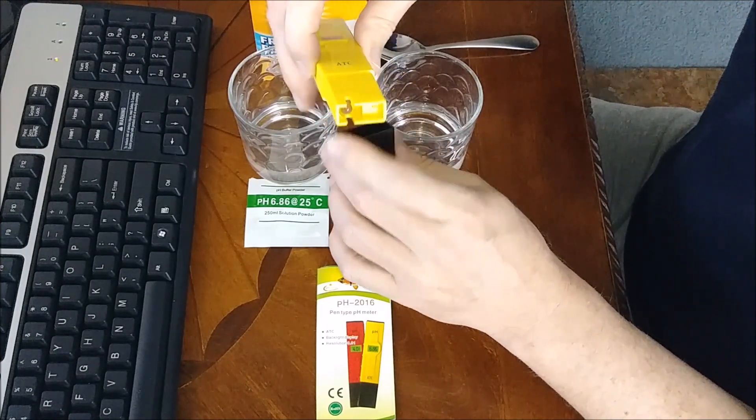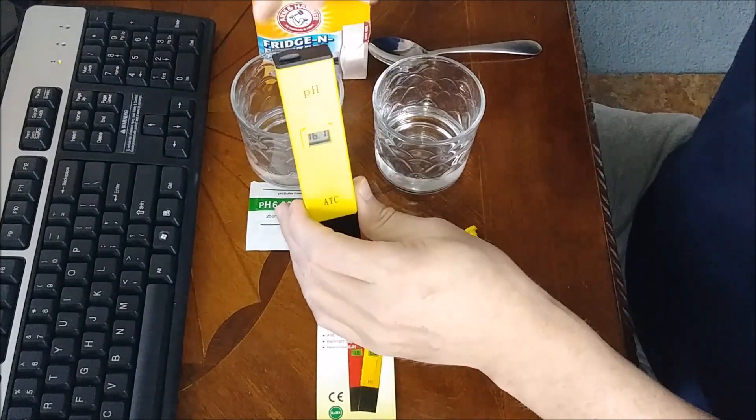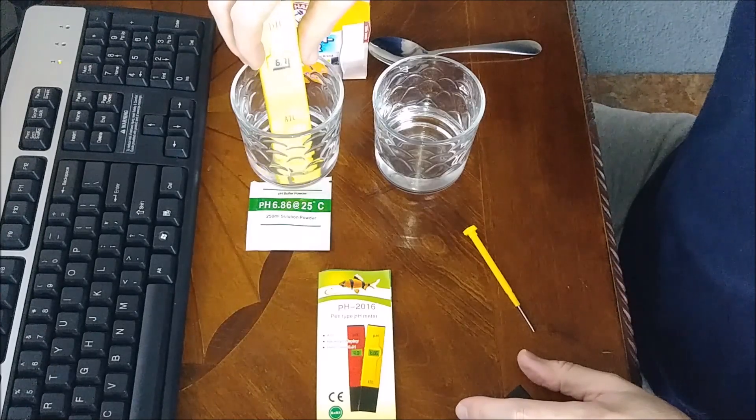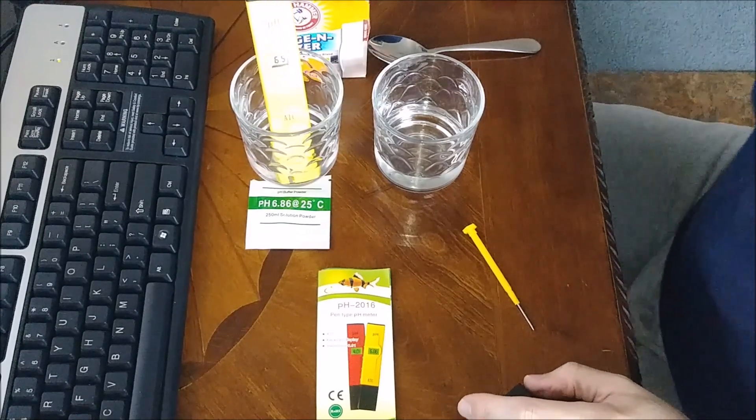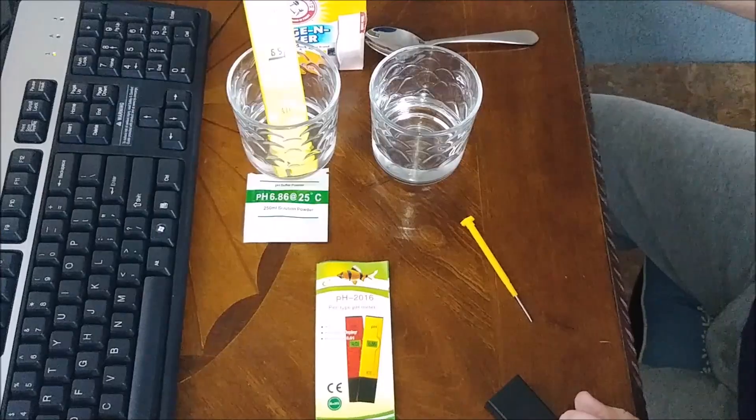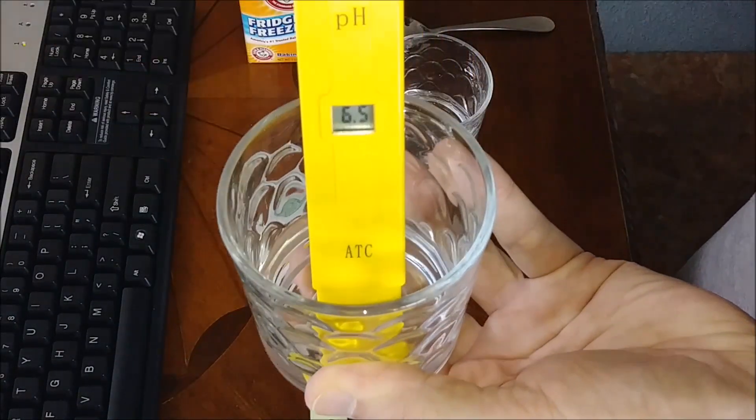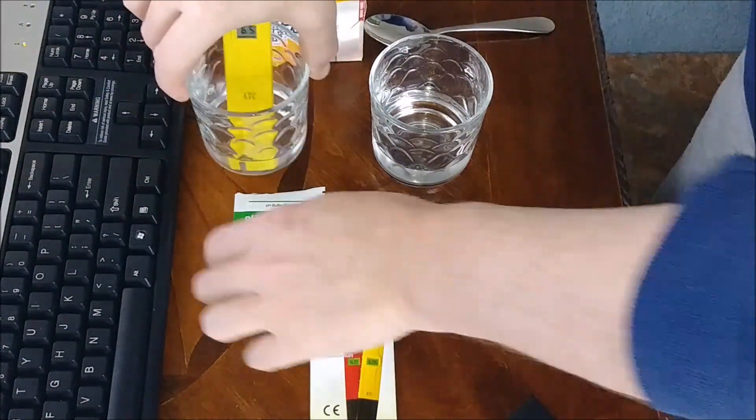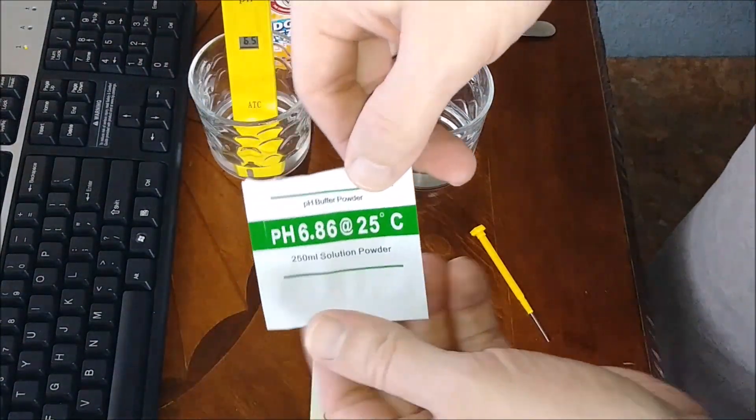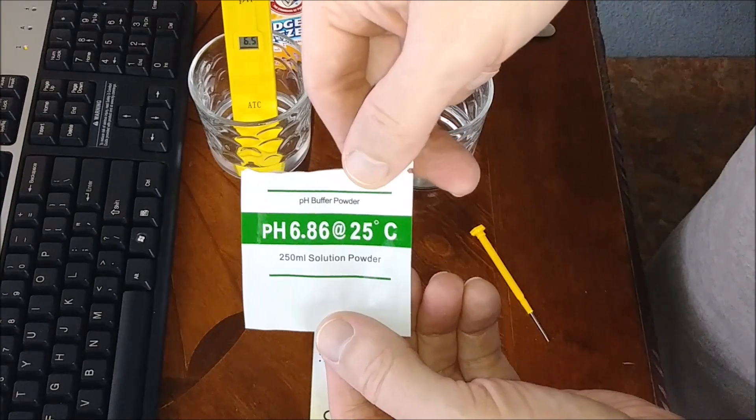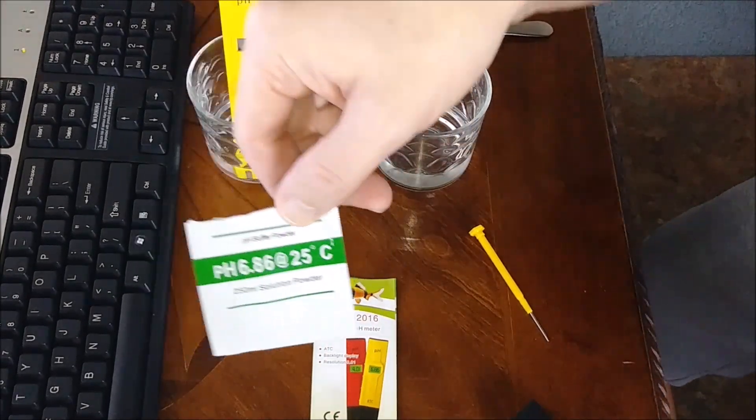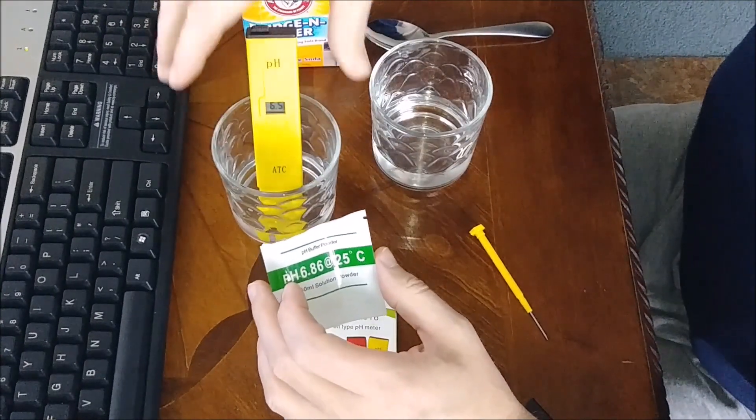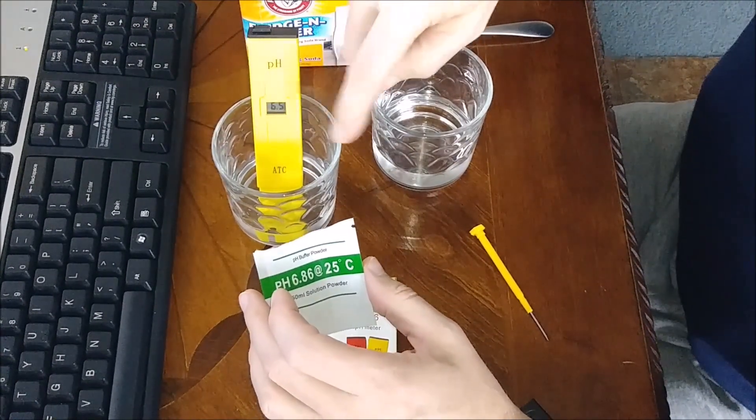I'm going to do this two ways. Now we'll go ahead and put this in the solution, and right now it just came up to 6.5. According to this little package here, it's pH'd at 6.86. You're going to want your ambient temperature around at least 70 to 75 degrees when you do your water; you don't want it too cold.